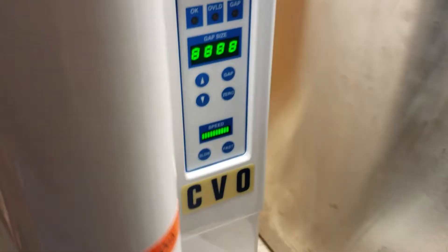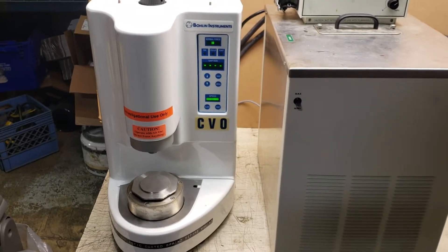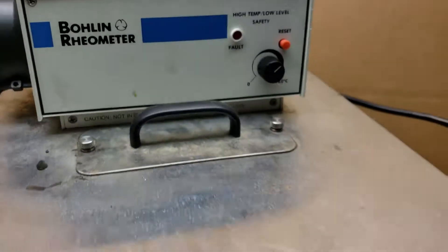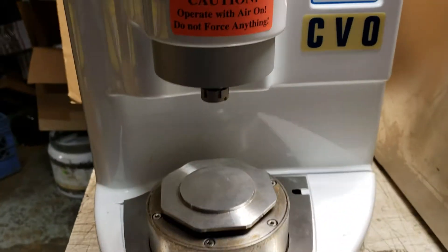I will turn the system on. I think it's beeping because it does not have air. But you can hear this thing's on right now — just came on, and the fan's blowing. This thing is definitely on.